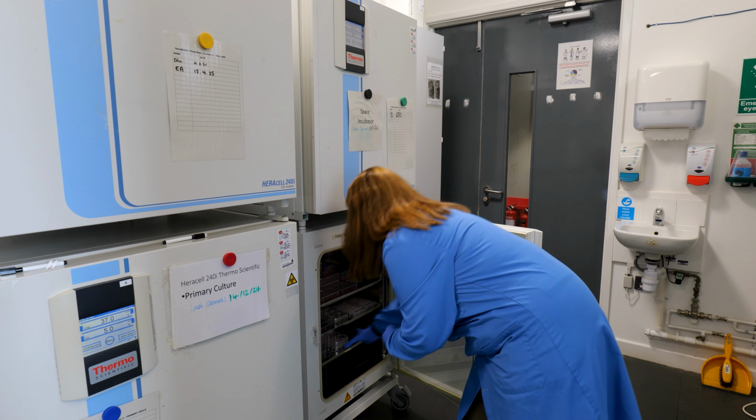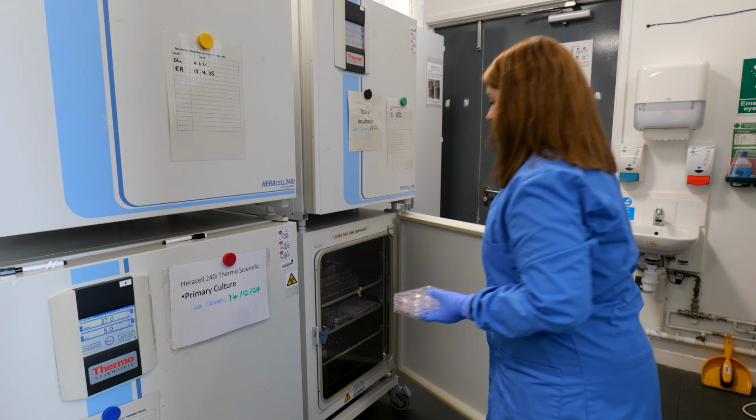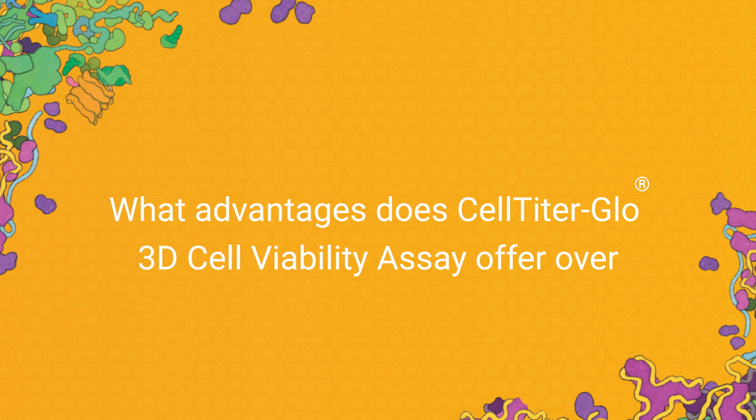One of the key questions that we are asking is, how does exercise impact on cell viability? So it's really critical for us to have an accurate, reproducible measure of that viability every time.